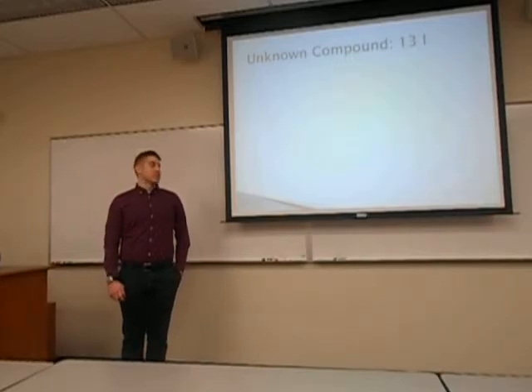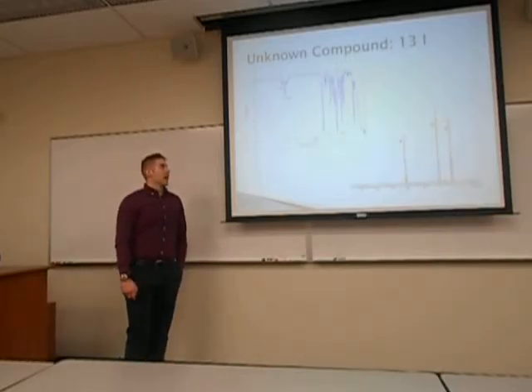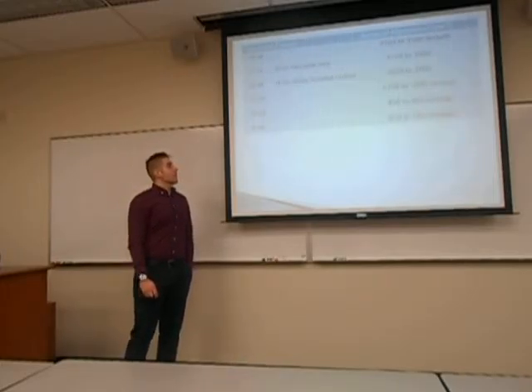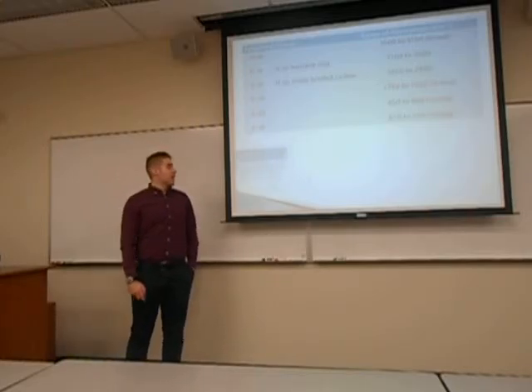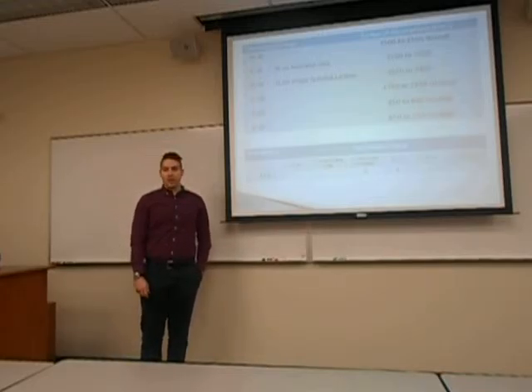My unknown was 13I, and these are the NMR and IR spectrum used for the 13I. I used the range of absorptions to find what bonds it might have, and I found that it has a carbon-hydrogen single bond and a carbon-oxygen double bond.